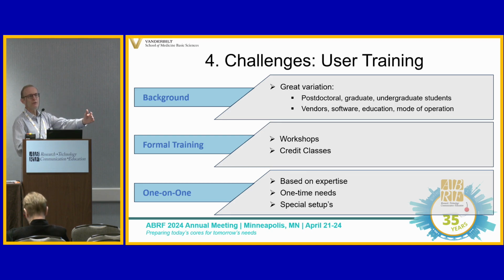A lot of the small molecule users, if they use automation, that might be fine. They might be good to go. But particularly people in the biomolecular facility, they often need more hands-on experience. And so what we then have to do is help them. Often they come with projects that they do maybe once in their PhD, like a whole backbone assignment suite. What do you do with them? We basically are of the opinion it's really not worth training them so they can do it on their own. So what we then say in these cases is, let's sit together, set it up together, and then we'll show you how you can analyze the data.